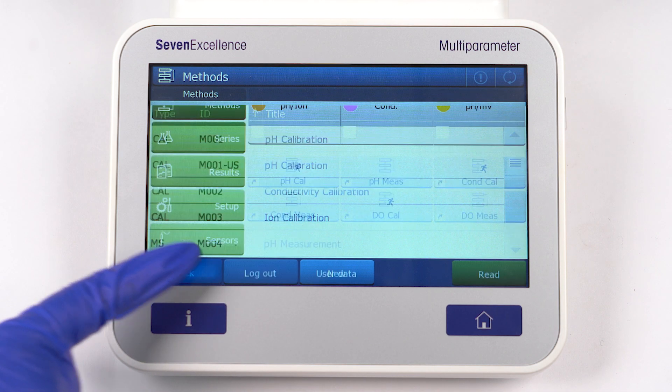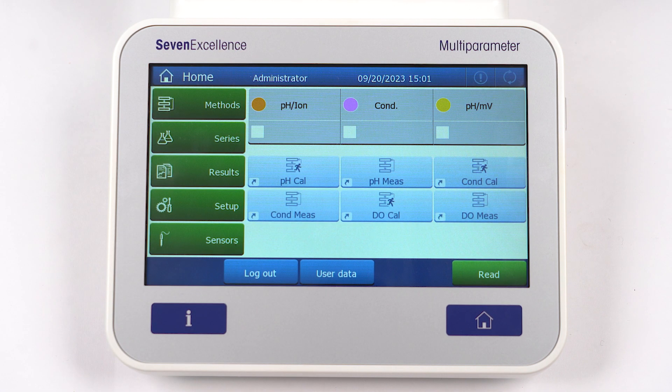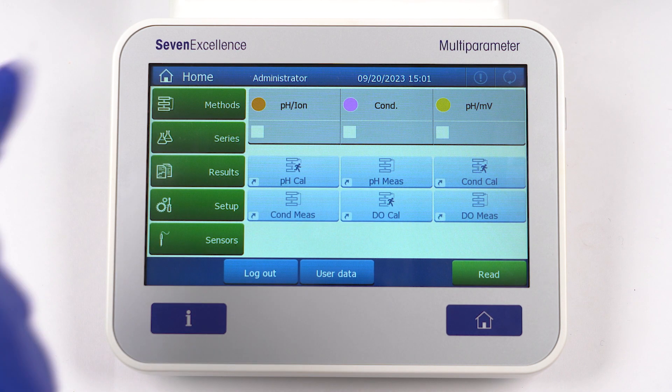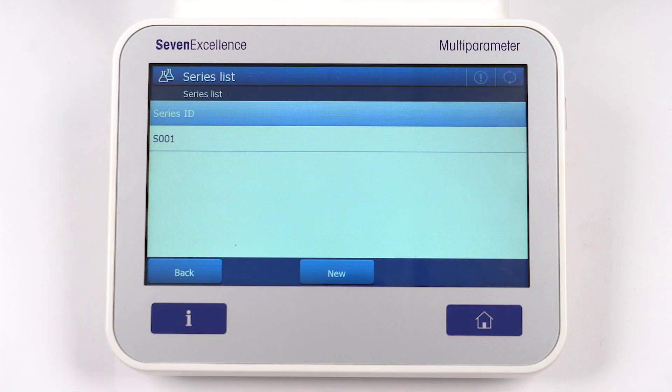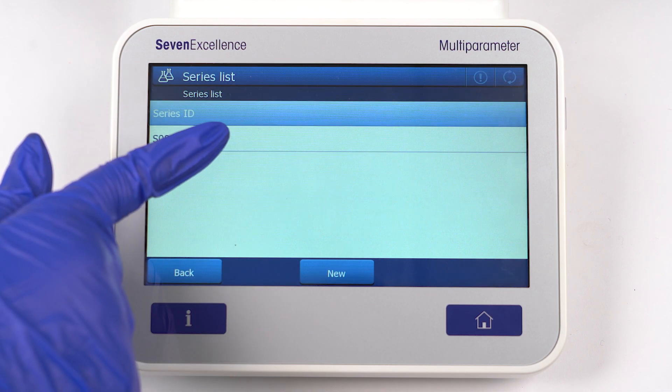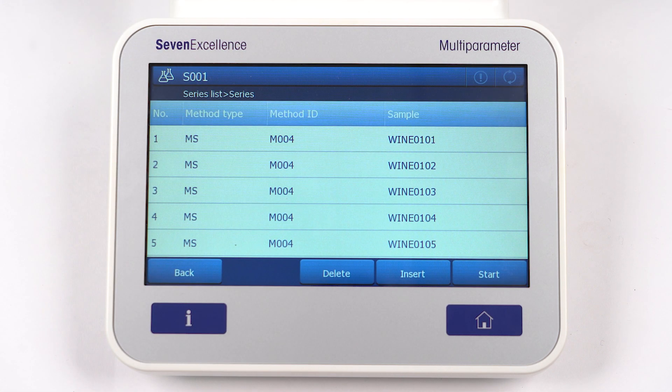Next up is the Series menu, where you can create measurement series. Simply select one method, define the number of samples and the sample ID, and you're good to go.